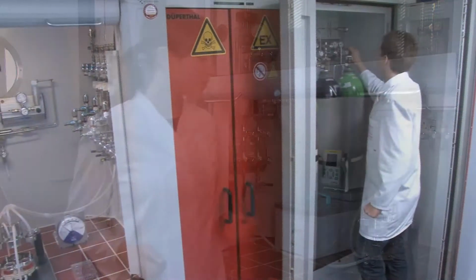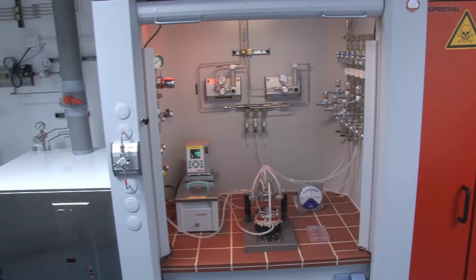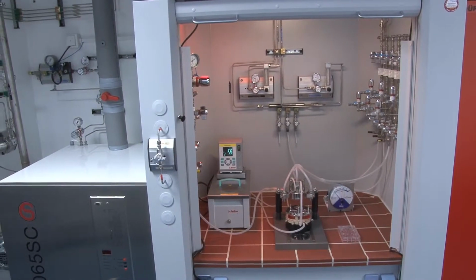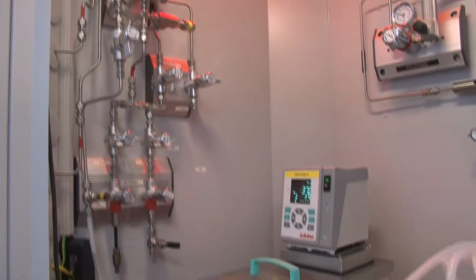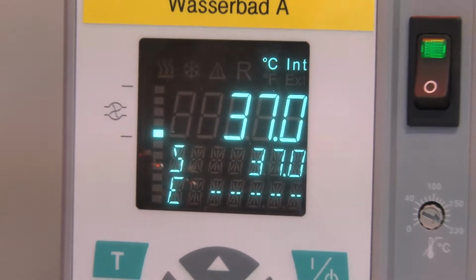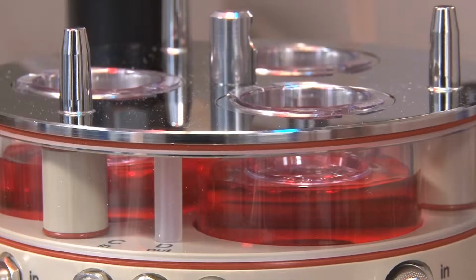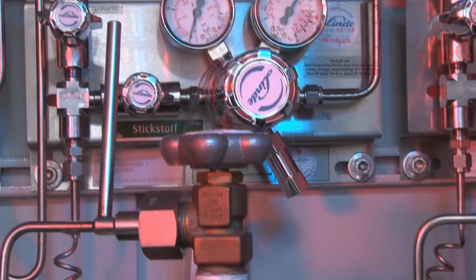Gases and gas mixtures place special demands on the tests, also regarding safety matters, especially when dealing with explosive or carcinogenic gases. With a self-contained system of gas supply, exposure, and subsequent decontamination of the test atmosphere, the entire process is possible under the highest safety conditions. Using the CULTEX RFS, direct contact between gas and cells is always achieved, even under such difficult demands.